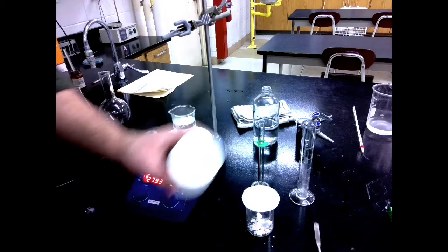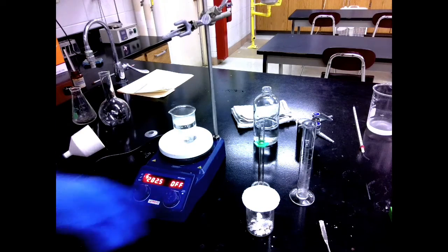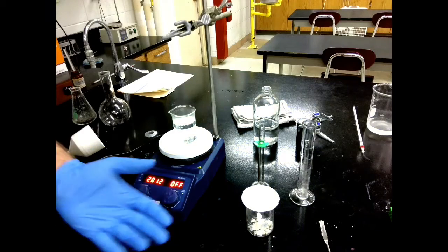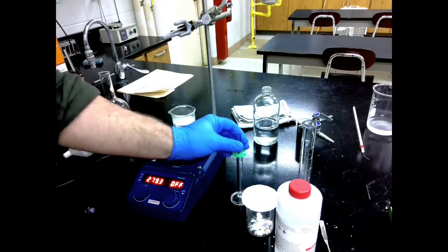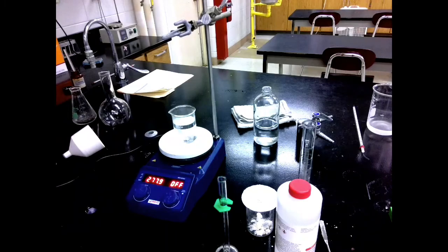For this next step, I'm going to need to be wearing some gloves, so I'm going to go put those on. All right, I've got my gloves on, and what I want to do is take this filter paper and get all of this aspirin off of it. And the way I'm going to do that is I'm going to use some ethanol as a solvent. So I've got my ethanol right here, and I need to get about 5 milliliters into this graduated cylinder. So once again, I'm going to be using a pipette to do that.